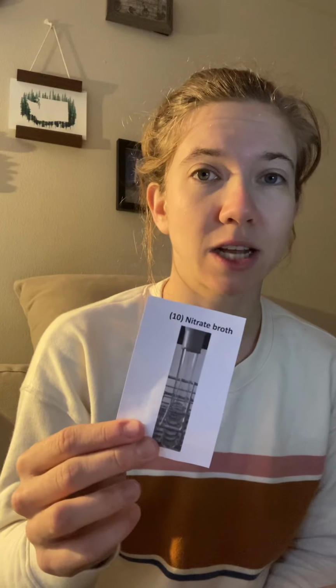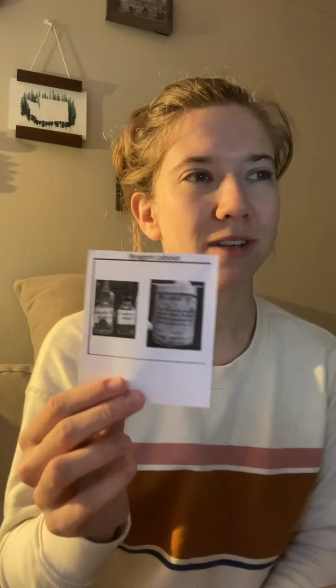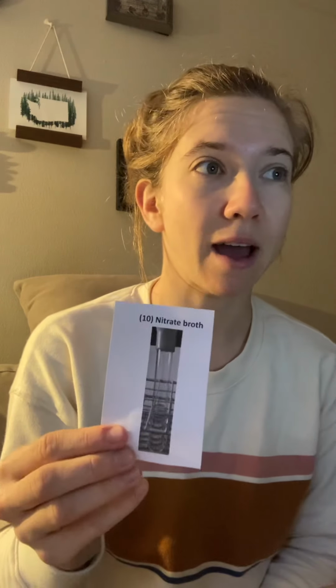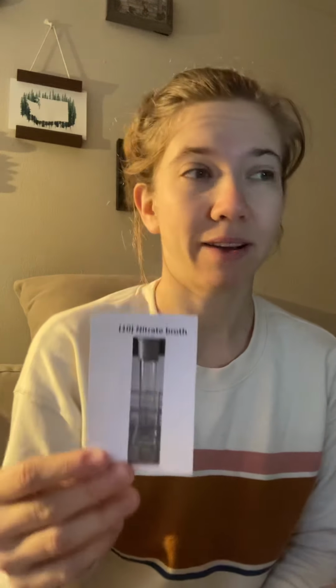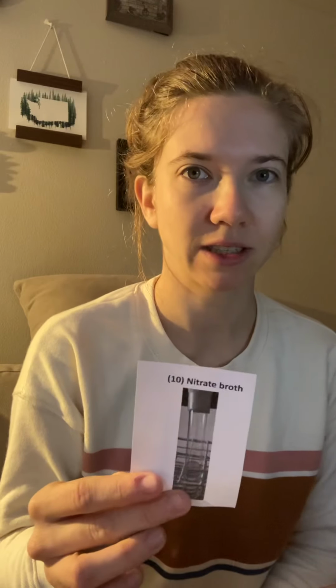In the nitrate broth cultures that do not have any color change thus far, I'm going to take a toothpick, pick up a few particles of the zinc dust and drop it into those broth samples, and you're going to mix that well. At this point, if the broth turns red, then it's a negative reductase result. If the broth does not turn red, then it's a positive reductase result.